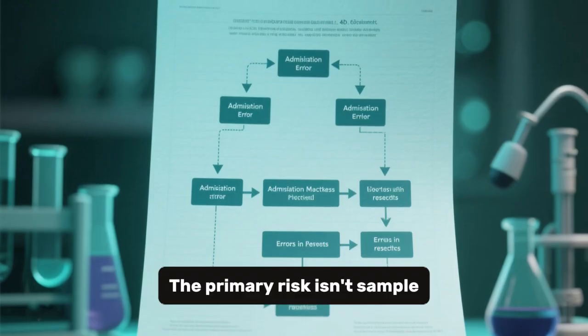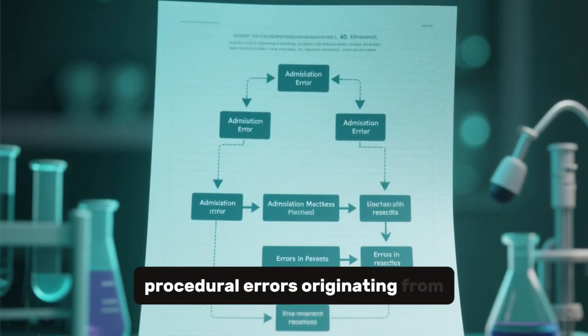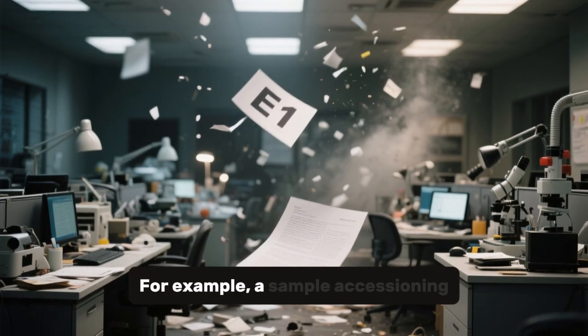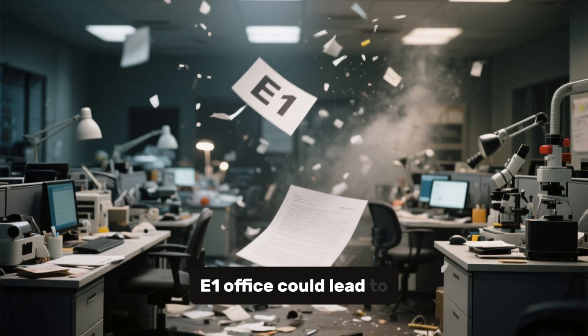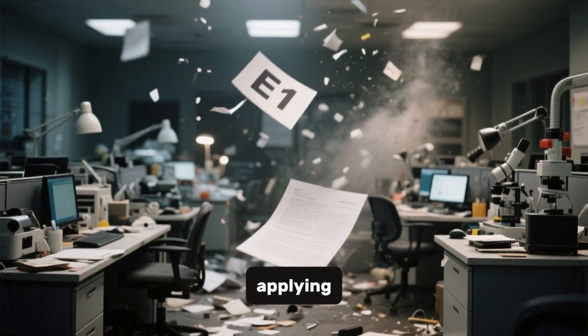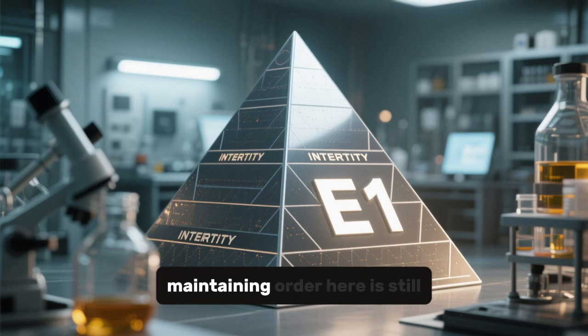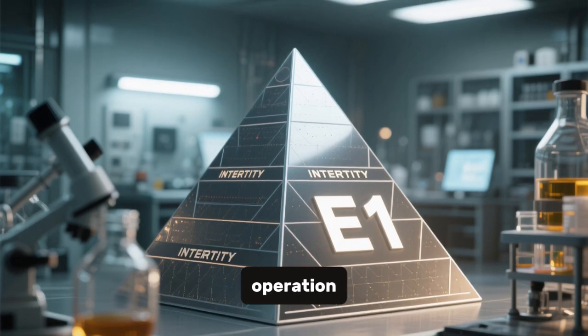The primary risk isn't sample contamination, but rather procedural errors originating from administrative mistakes. For example, a sample accessioning error made in an E1 office could lead to testing the wrong sample or applying the wrong method later on. So while it's low risk, maintaining order here is still foundational to the entire lab's operation.